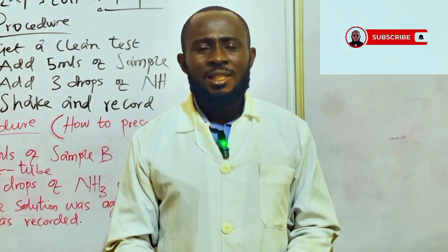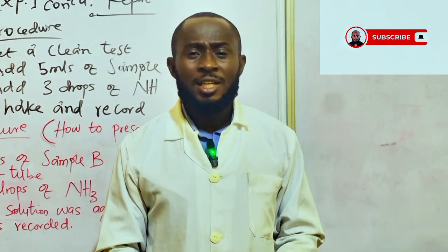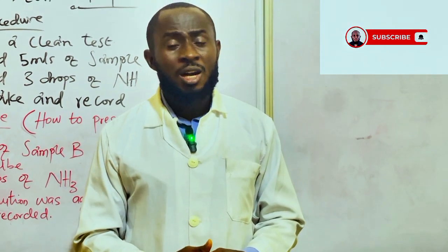Today we'll be testing our aspirin, the aspirin we prepared in the previous video. Today we just have to test it. There are two ways to test aspirin. One is through melting point. The other one is by using ferric chloride.